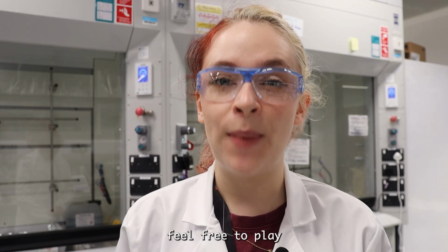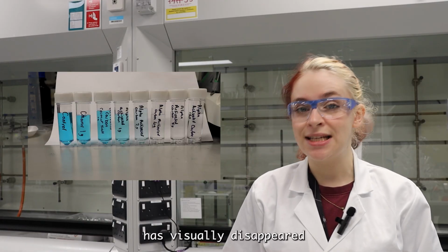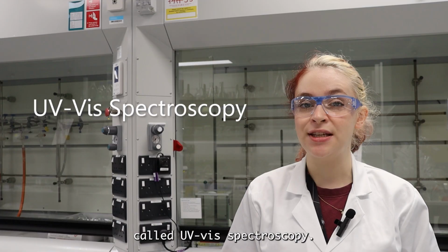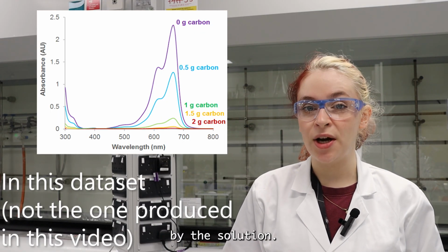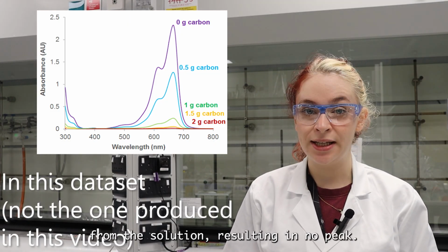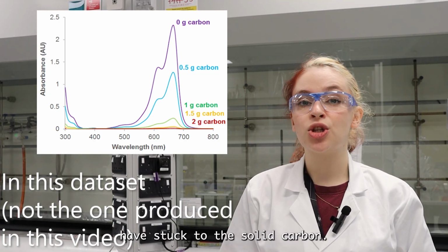Once again, feel free to play this as a part of your lesson. It's easy to see how the colour has visually disappeared from the solution, but it's also possible to more accurately measure this using a technique called UV-vis spectroscopy. The peaks in the graph are where the light is absorbed by the solution. So when 2 grams of carbon is added, no light is absorbed from the solution, resulting in no peak. This is because the solution is now colourless. All the coloured molecules have stuck to the solid carbon.